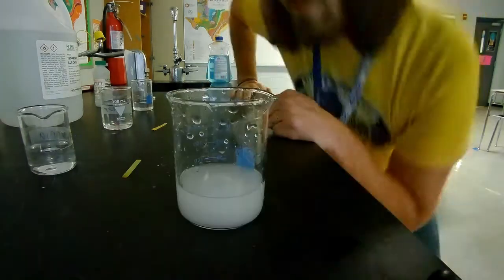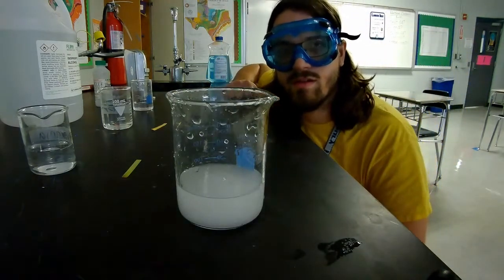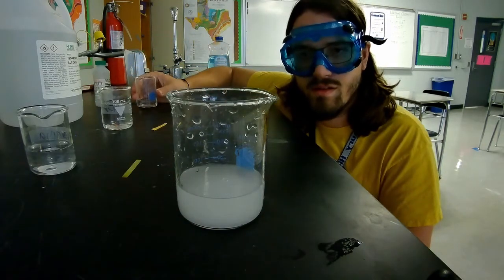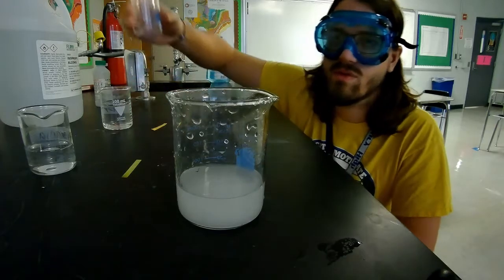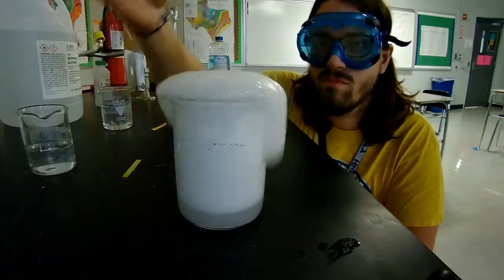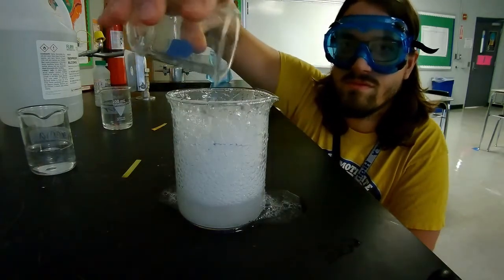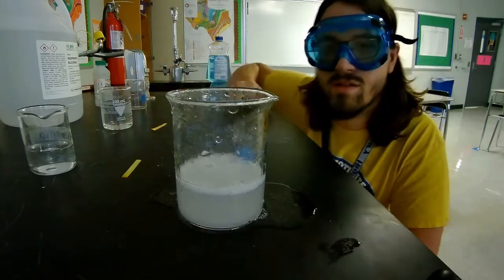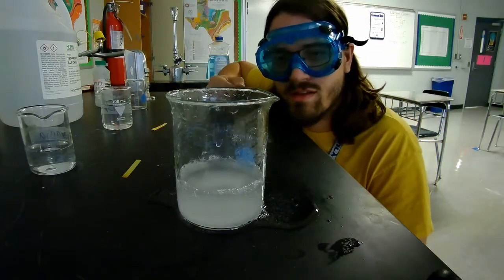Let's see. All right, so we've got our baking soda in there. Let's see what happens. I'm gonna dump the rest of my hydrochloric acid, and let's watch and record what we noticed. Well, that was a little bit more exciting.